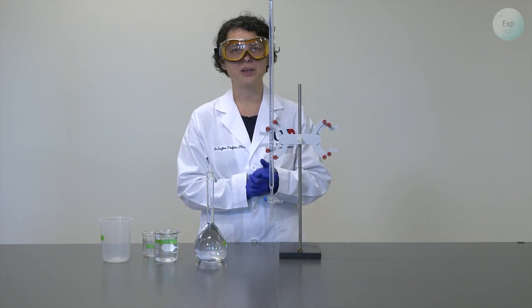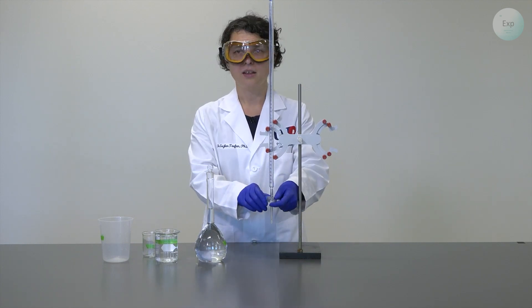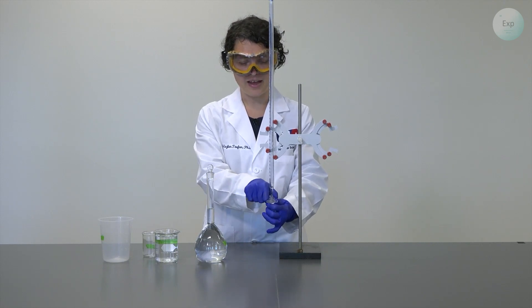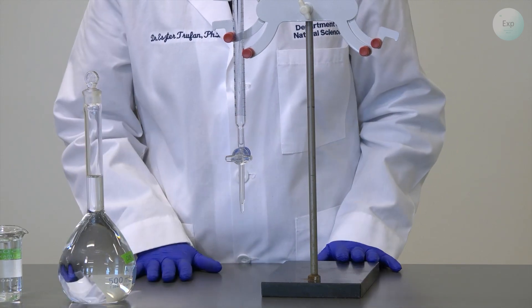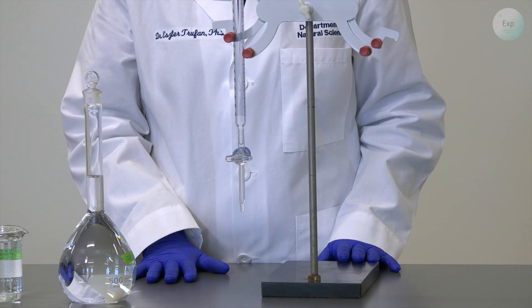So to get started, we're going to fill our burette completely with deionized water. To do that, first, we make sure that our stopcock is in the closed position. And that means that it has to be perpendicular to the orientation of the burette.